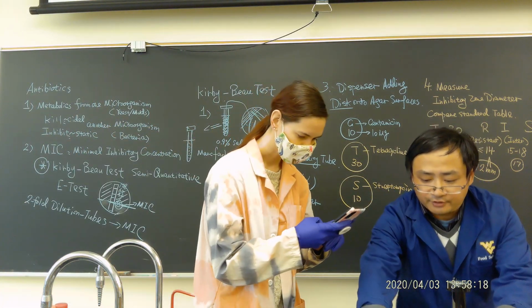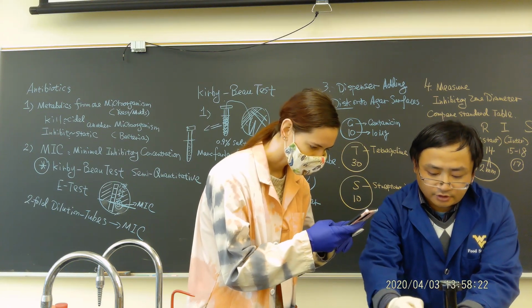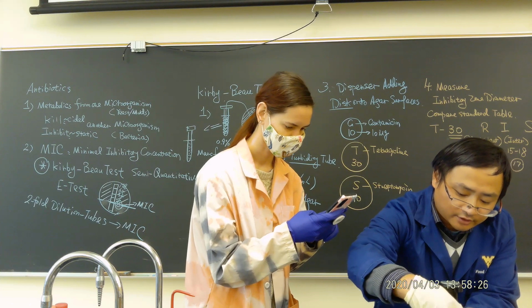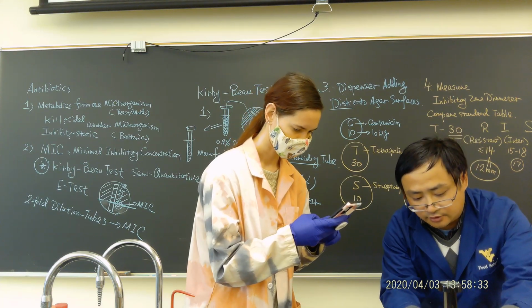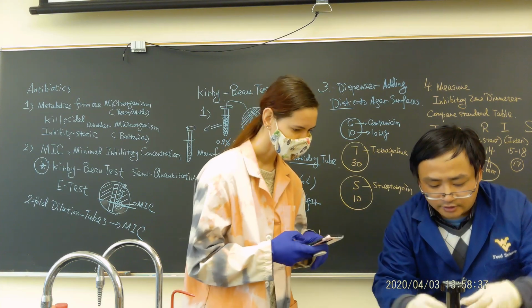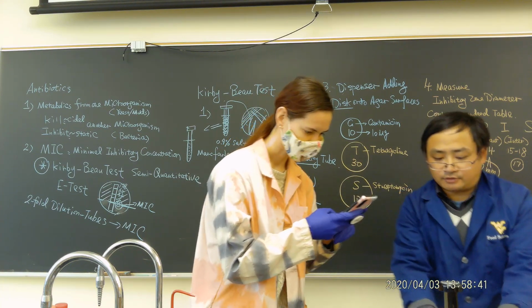This is a disc, very clear. Okay, this is a disc. We're going to have to add in. So when we add in, we put one there, put another one there. This actually should go down. I don't think this one works very well. So, okay. Then another one I usually put on the side. So you can take a picture right now for this one.